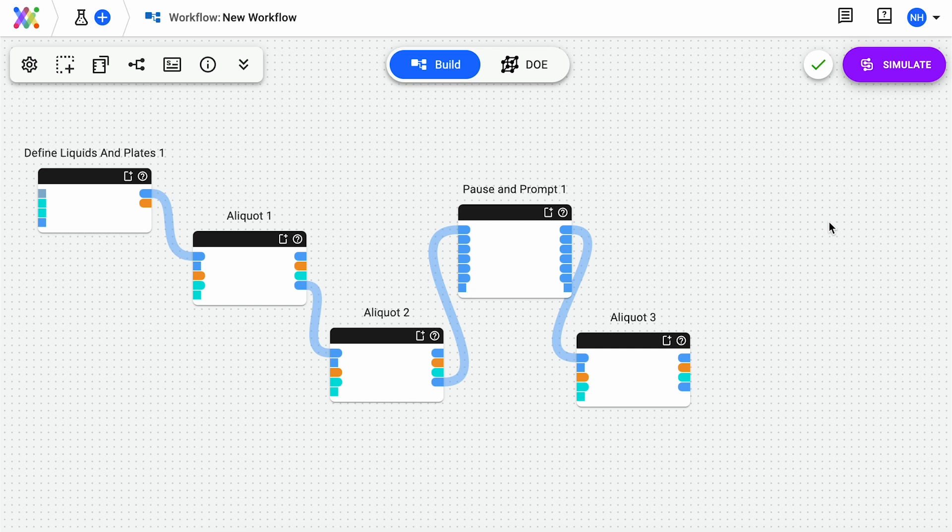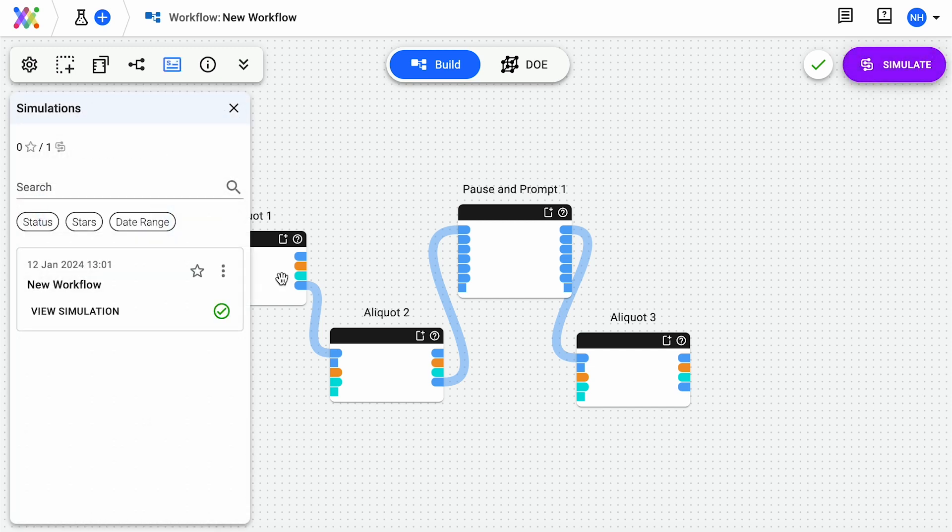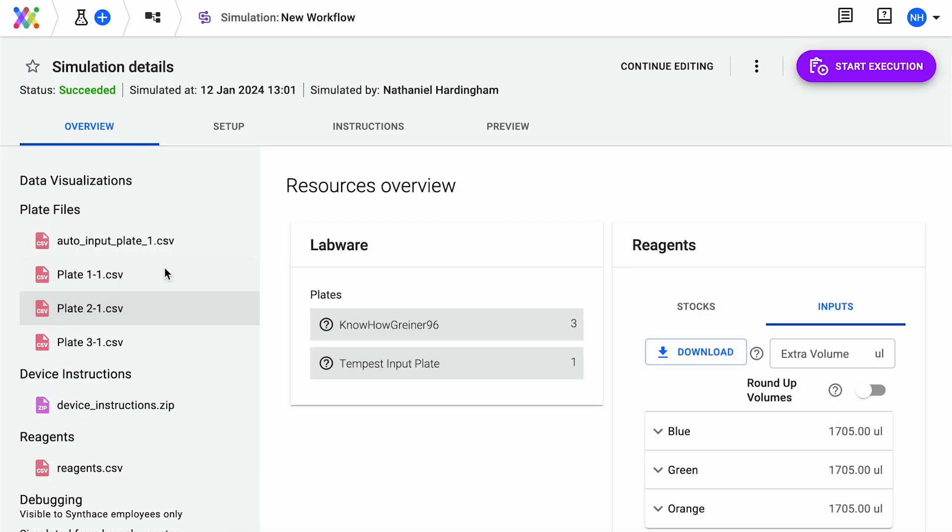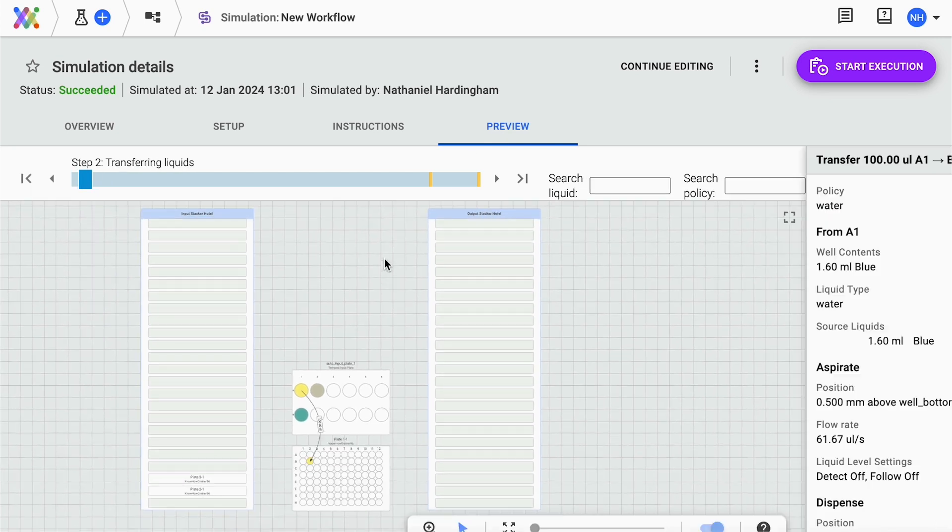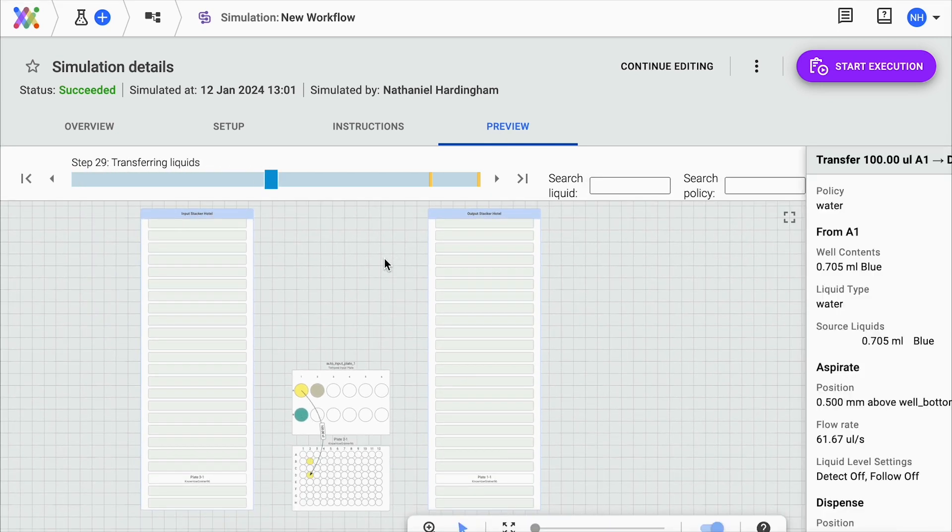When you're happy with your workflow, click Simulate. Synthase will digest the information from your workflow and generate instructions for your Tempest shown in the Preview tab.